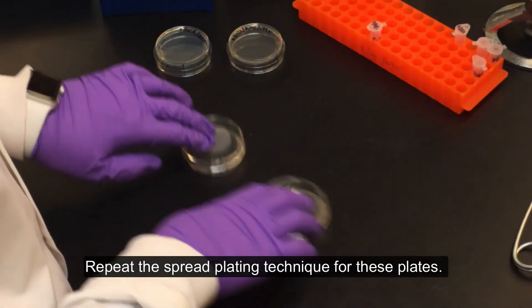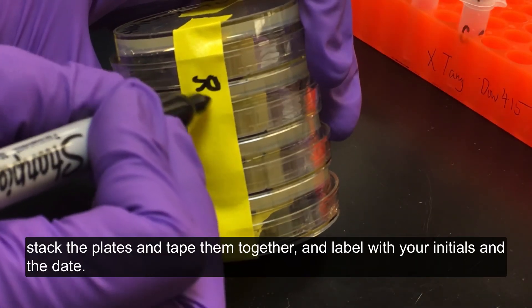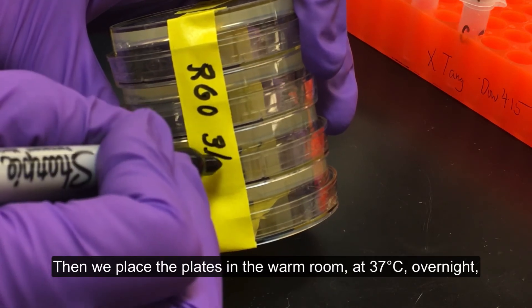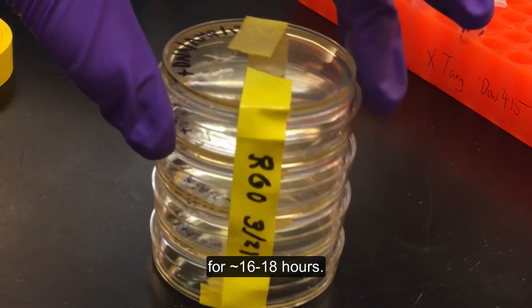Repeat the spread plating technique for these plates. Once the liquid has been absorbed by the agar, stack the plates and tape them together and label with your initials and the date. Then place the plates in the warm room at 37 degrees Celsius overnight for approximately 16 to 18 hours.